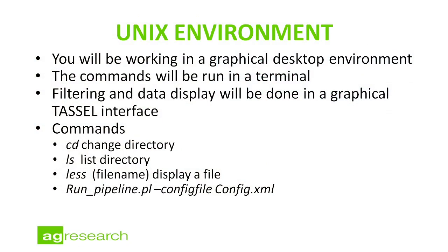Okay, so you'll be working in a graphical desktop environment, a Linux environment, which is actually what I'm running up here today anyway. The commands will be run in a terminal window, so you'll be doing a little bit of typing. We'll do filtering and data display in a graphical Tassel interface, that will be Tassel 4. The pipeline will be Tassel 3.